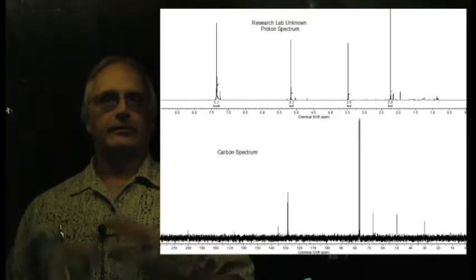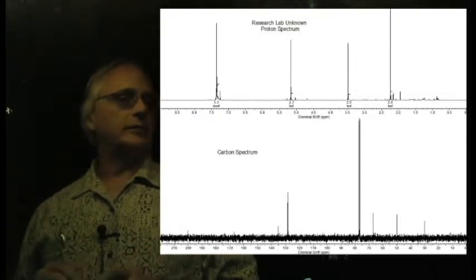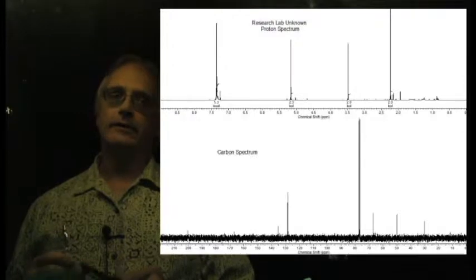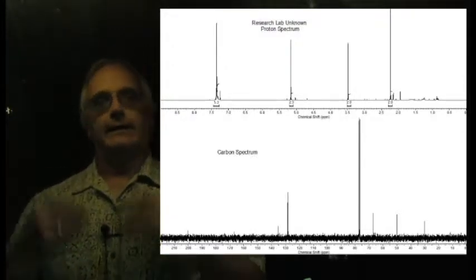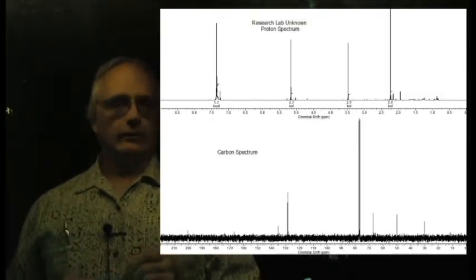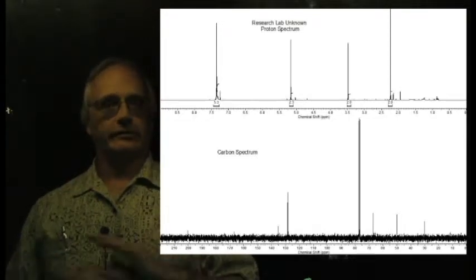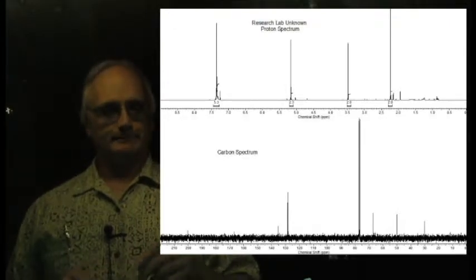This one was a molecule they're trying to confirm the structure of before they made use of it in a further synthesis project. It also illustrates a couple of facts that we've talked about in NMR. As presented when we acquired the spectrum, the carbon spectrum was not a very clean one at all. This was not a terribly concentrated sample, and that natural abundance issue, only 1% of our carbons are actually magnetic. So when we run a carbon spectrum, our concentration drops by a factor of 100, essentially.